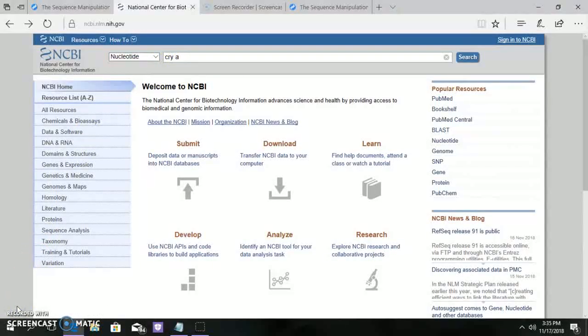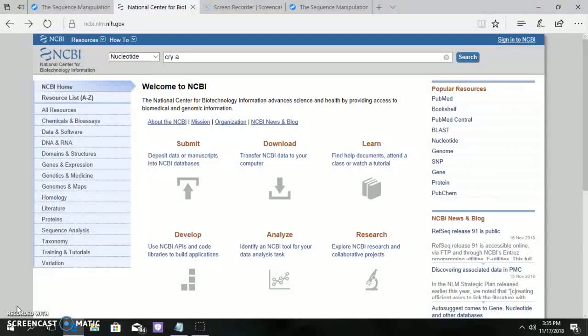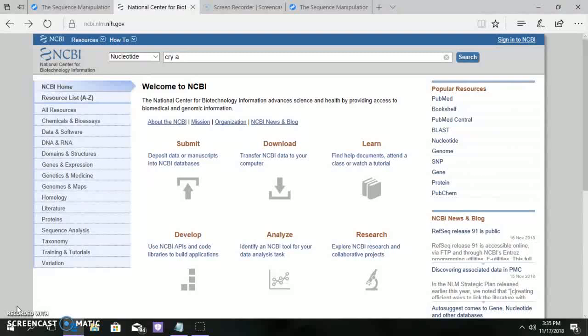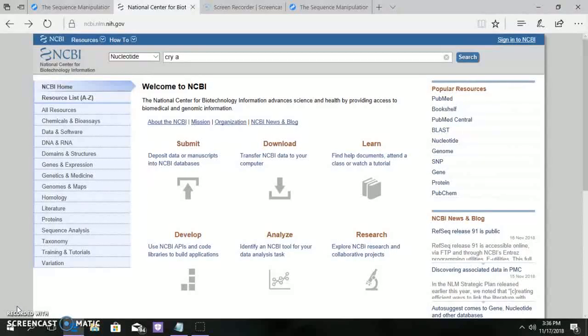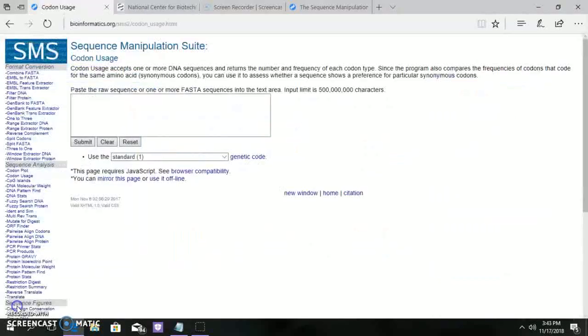Here I am going to explain about Cry protein using the tool Sequence Manipulation Suite. Cry gene produces an insoluble inactive crystalline protein which is converted into soluble toxic and active form in the gut of the insect due to alkaline pH and protease. Now type the sequence and then go to Sequence Manipulation Suite.